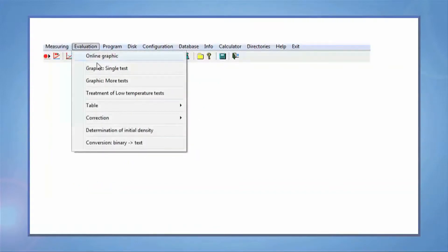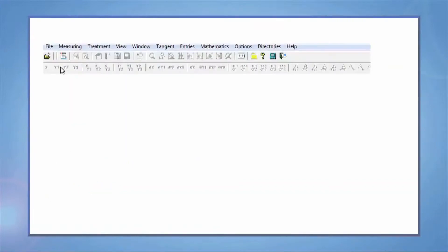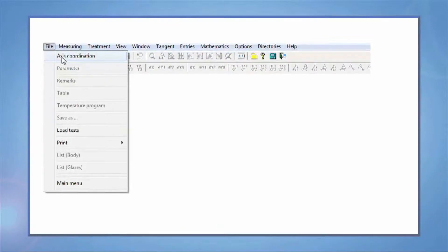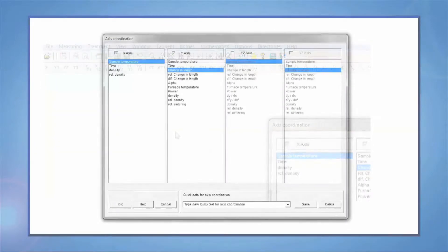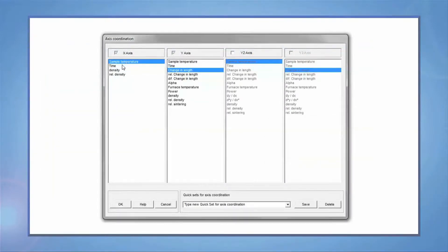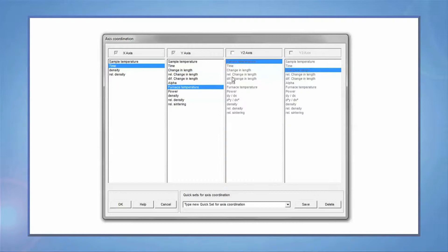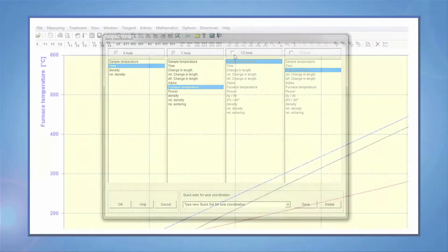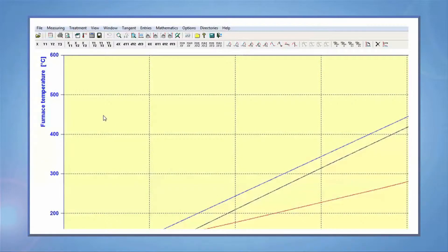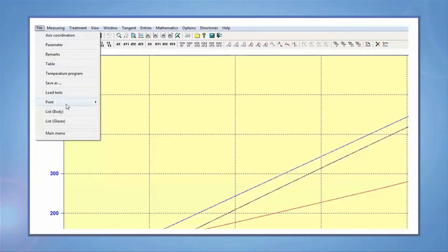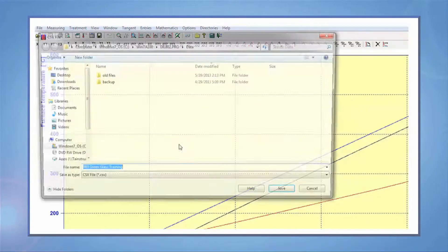Let's take a look at the files tab. Let's pick the axis coordination. Here you can customize your data by picking different variables. For exporting to an Excel file, you need to go to print and select print CSV file. You can then open the file in Excel.